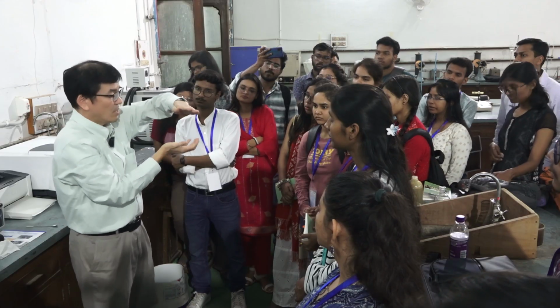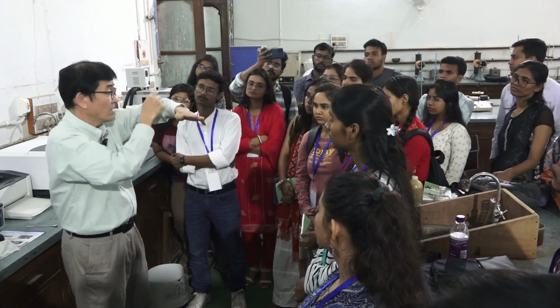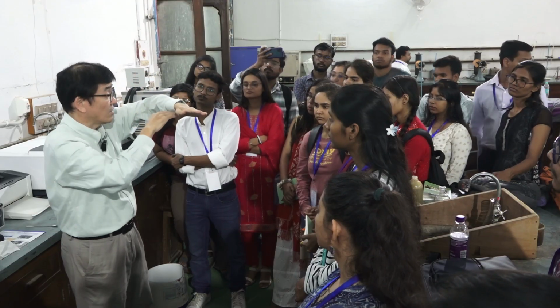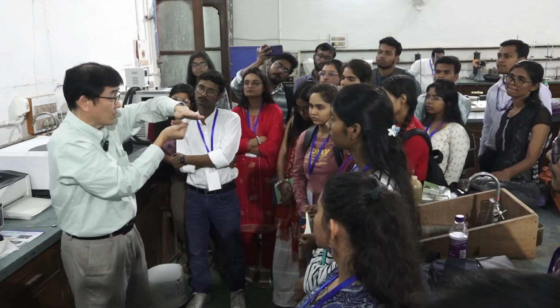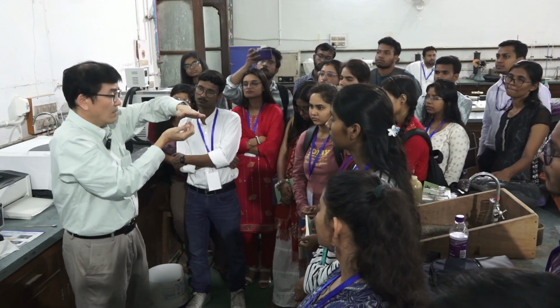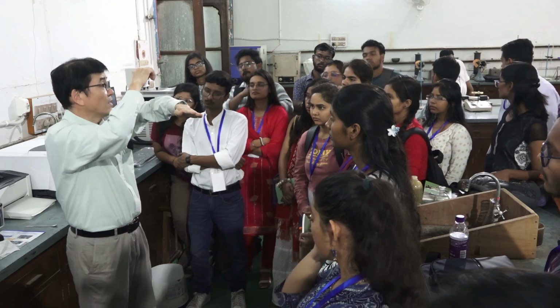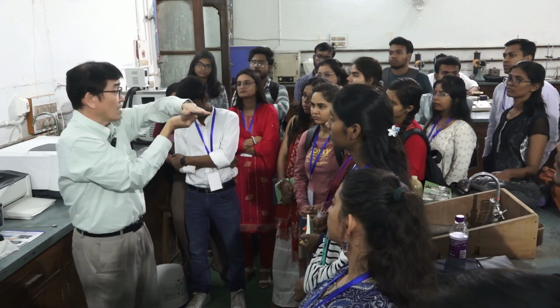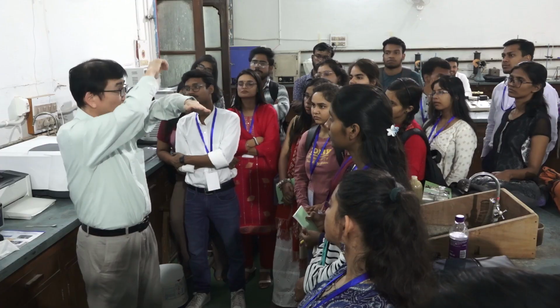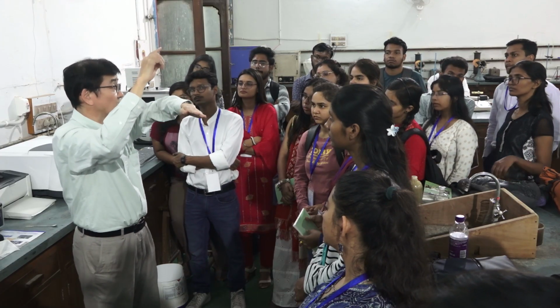Then when we touch the liquid sample here, the evanescent field is generated on the surface, and it is absorbed by the sample. By comparing the intensity of the light without and with sample, the energy of the total reflected light becomes different.